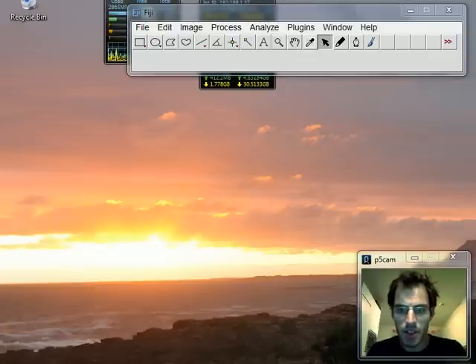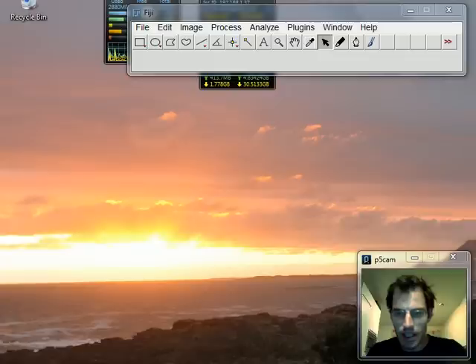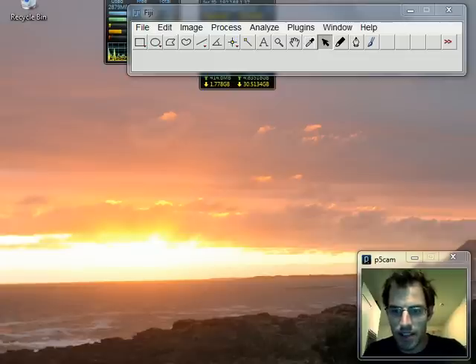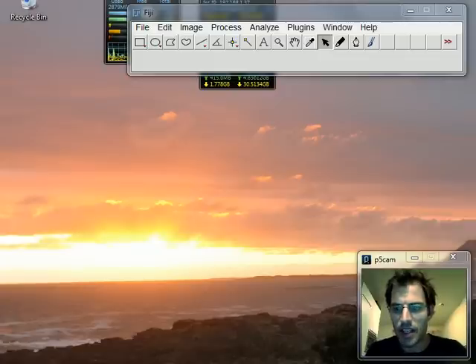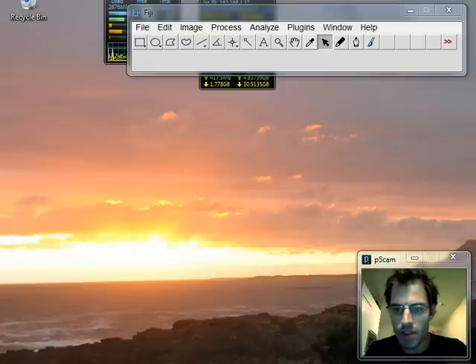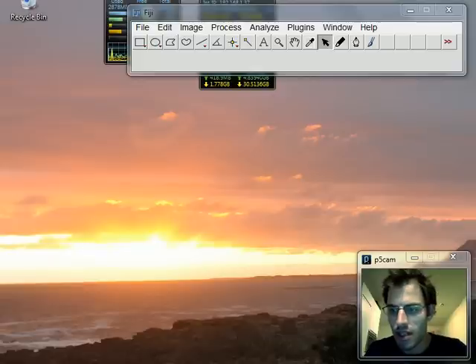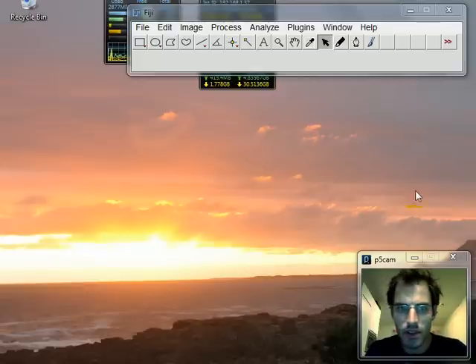Here's one more screencast showing you how easy you can align automatically a stack of slices using the TrackEM2 plugin in the Fiji software. This is to complement my other screencast where I show you how you can manually do this same alignment.